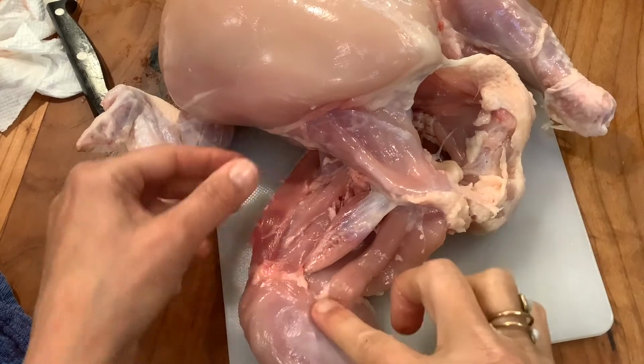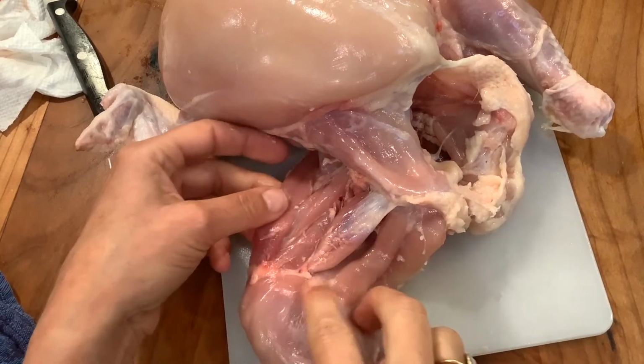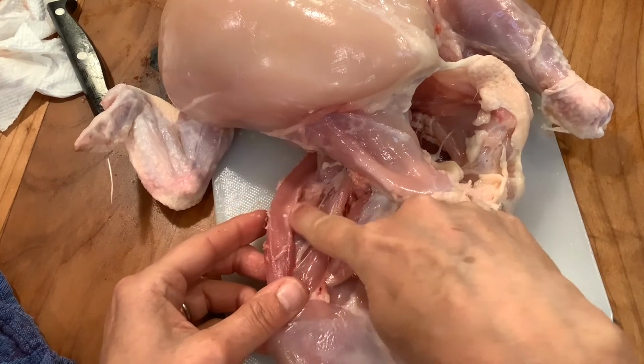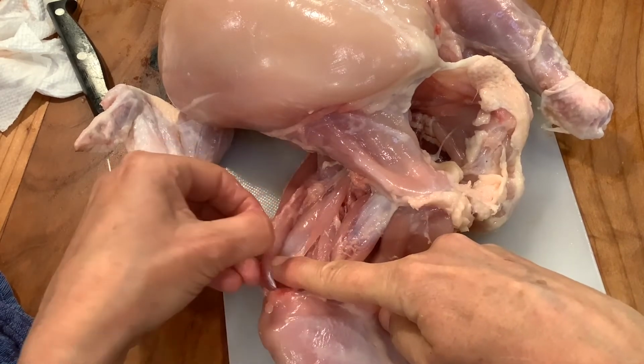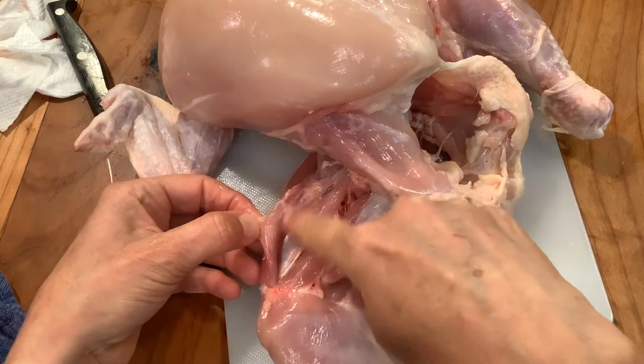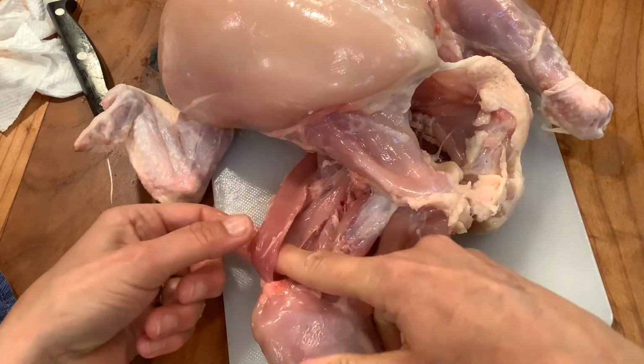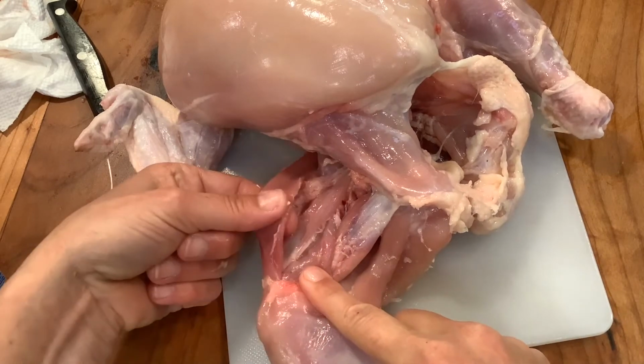So I've been working on this for a little while, and I think I found some things for you to look for. So this is the edge of the sartorius, and it's getting a little goofy under here. I can't tell if I've gone too deep, but it seems like it's too thick, thicker than it should be. But that would be the sartorius.